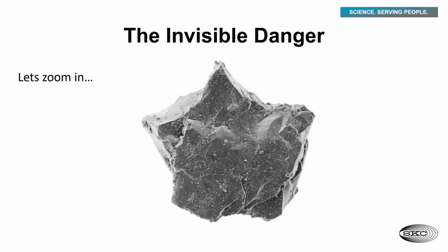And so as you zoom in and in and in, what looks like a little shiny, sharp arrowhead is actually a silica particle that has been magnified a ton. Now, as you look at this particle, you'll see that it's very jagged, it's very sharp, and you can imagine if this was life size, you definitely wouldn't want to handle that without gloves on, because there's a good chance it's going to cut your hands.